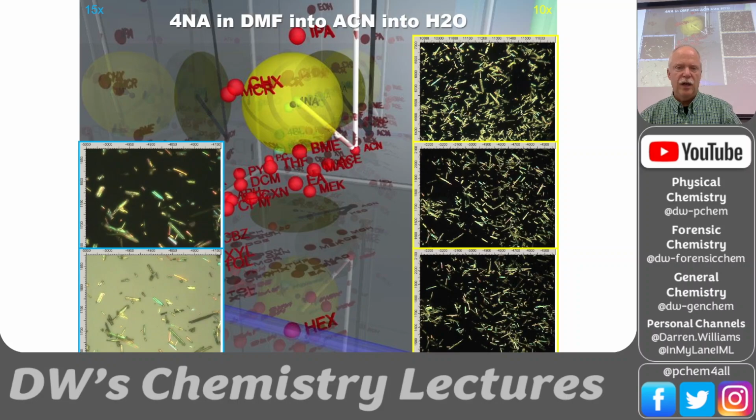And then here we're going into acetonitrile and then to water. So we're exiting that solubility sphere in a different direction, and we're seeing even skinnier crystals. So the length to width ratio has increased by picking a different path out here. So we're really stabilizing one of those polar faces and causing the other faces to grow. Okay.